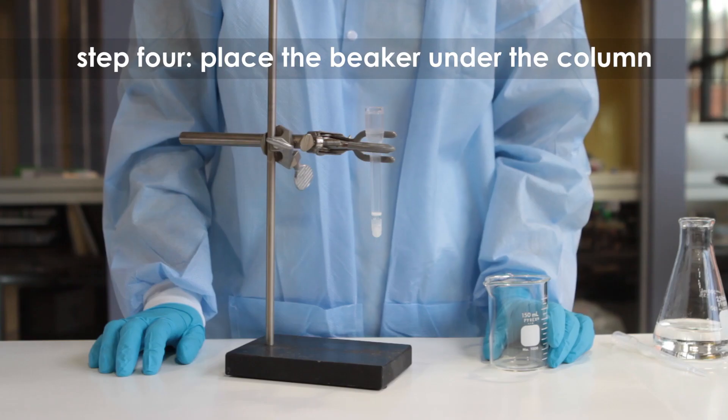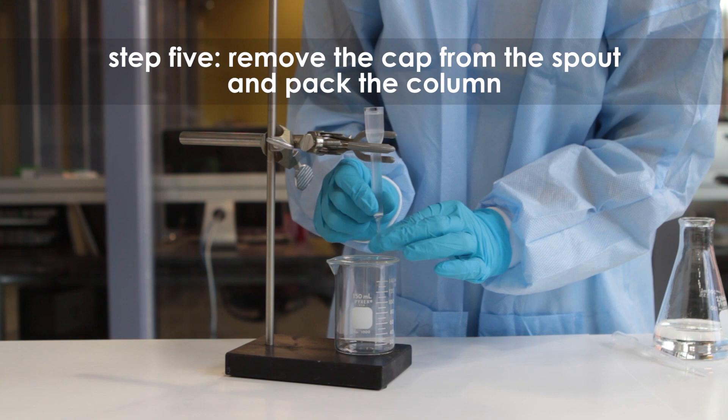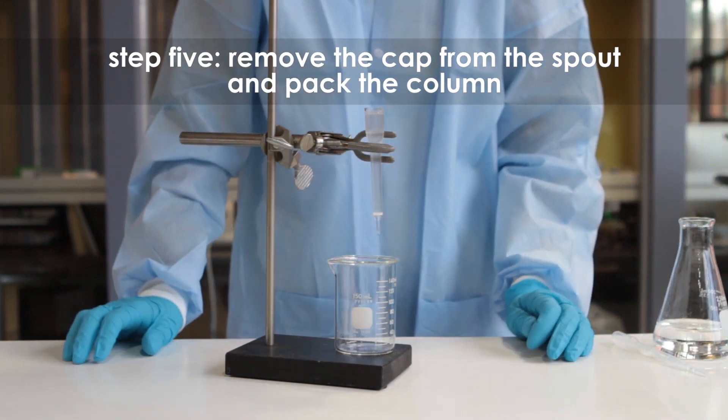Step 4: Place an empty beaker under the column. Step 5: Remove the cap from the spout of the column. The buffer will begin to flow through the column.